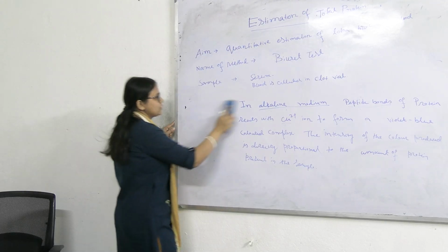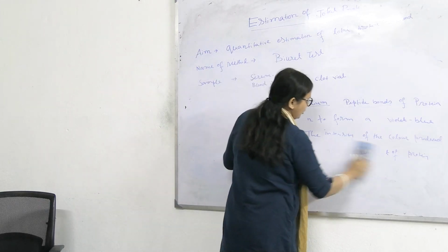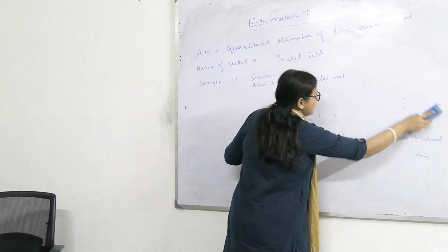Now why is the name Biuret? Because besides the peptide bonds, there is another compound.